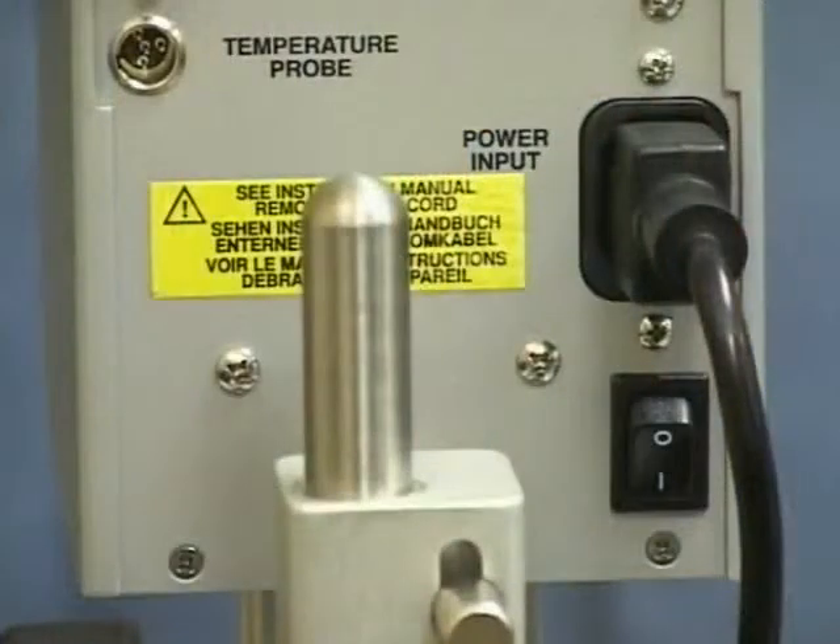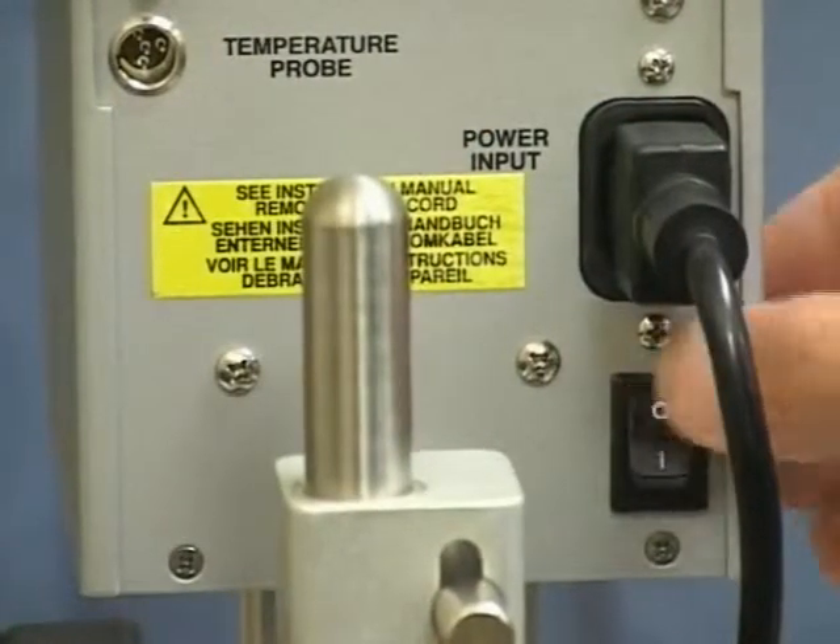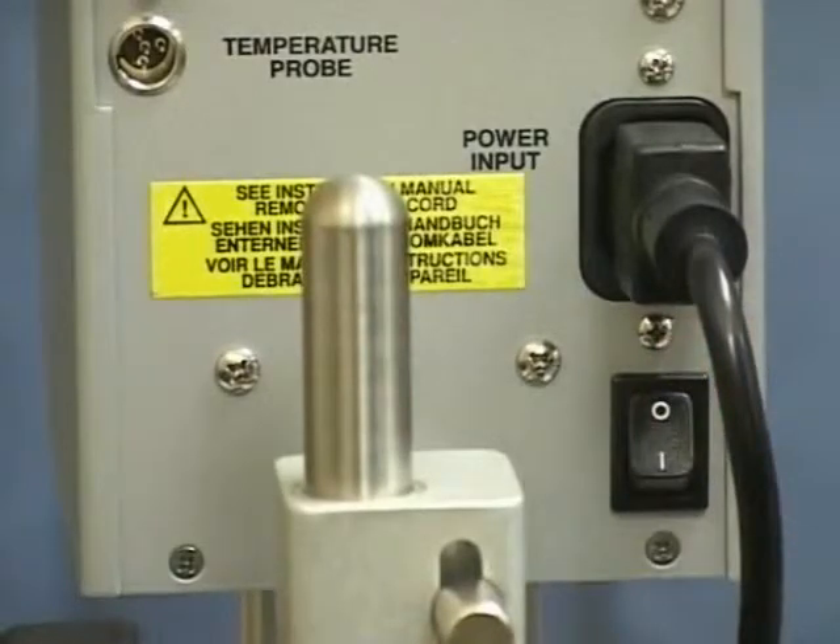To turn your instrument off, switch the power button on the back of the viscometer to the off position.